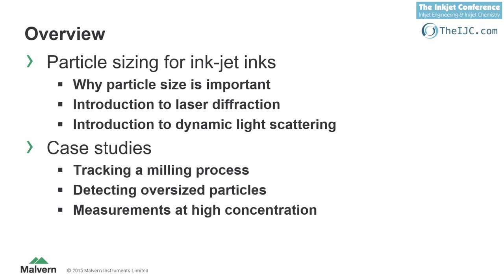So to give you an overview of my presentation, we'll start by looking at why particle size is important for inkjet inks. So we'll look at a couple of reasons why you need to measure the particle size. We'll then introduce two of the more common technologies that we use to measure particle size in a wide range of industries, including inkjet inks.